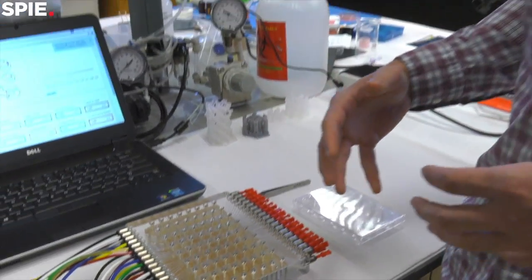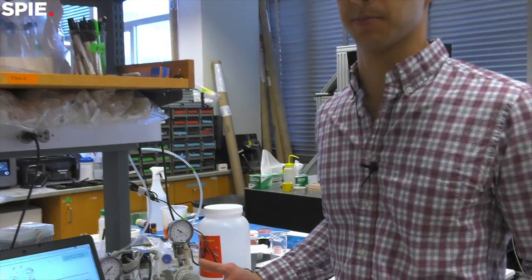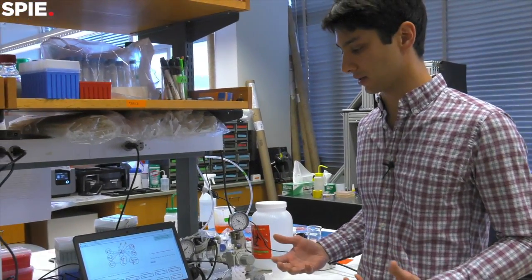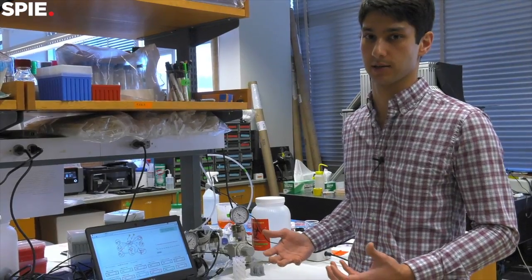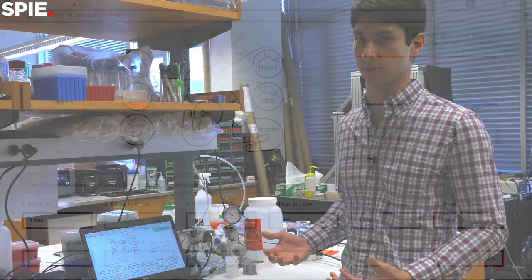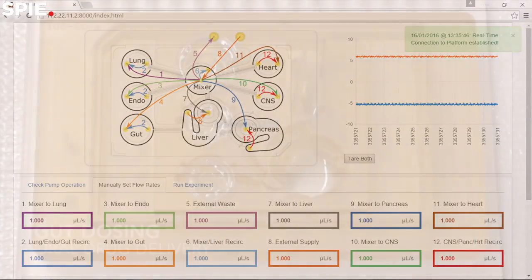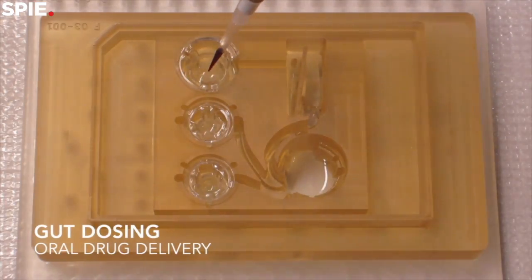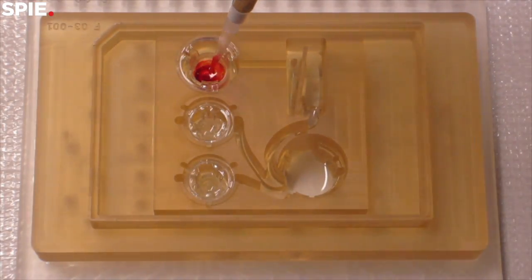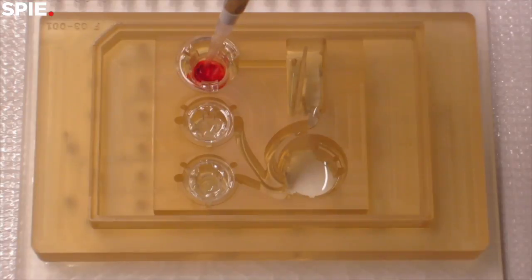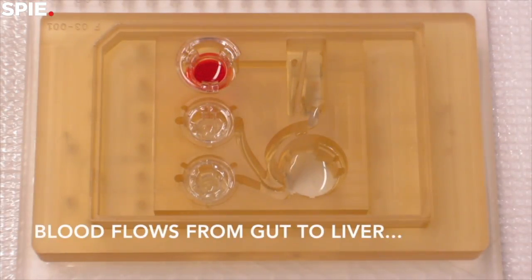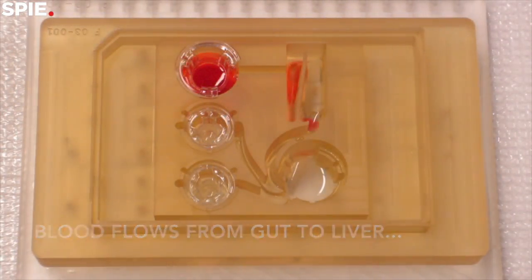As air and vacuum are pumped into these lines that run along the length of the acrylic plate, air is channeled through a via into the pump chambers themselves and pushes the membrane into or out of the fluidic plate. This forces fluid along, it's a peristaltic pump, so it provides a discrete known displacement per second, so we can control the pump rate very accurately and use that to individually control the mixing within and the mixing between each organ system. That allows us to generate very physiological biodistribution profiles of drugs or secreted factors in the system, which is a degree of control that most systems don't have.